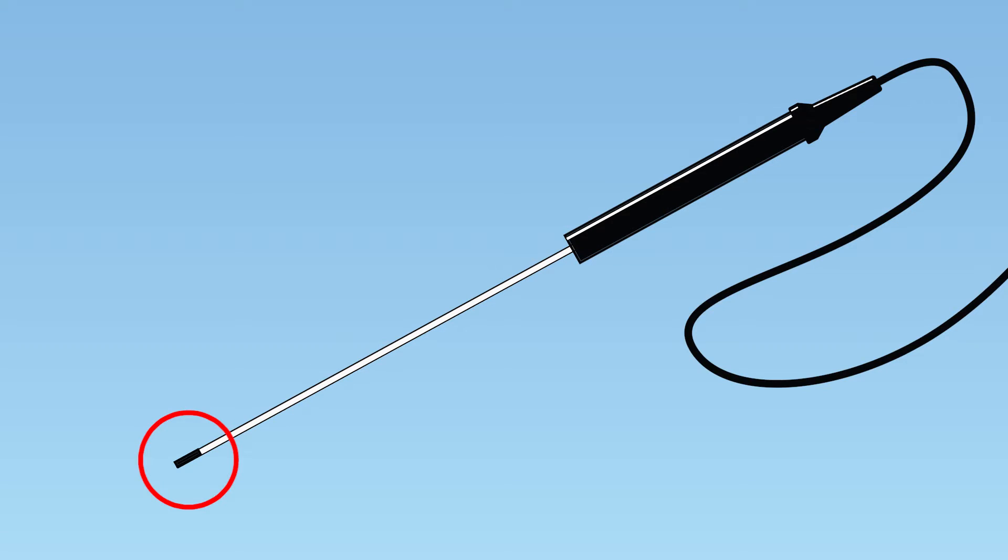The tip of the sensor contains both the oxygen sensing element and a separate reference electrode. These are enclosed by a two millimeter sleeve filled with electrolyte. A gas permeable polymer membrane on the end of the sleeve allows oxygen to pass through while blocking liquids, ions, and particulate matter.